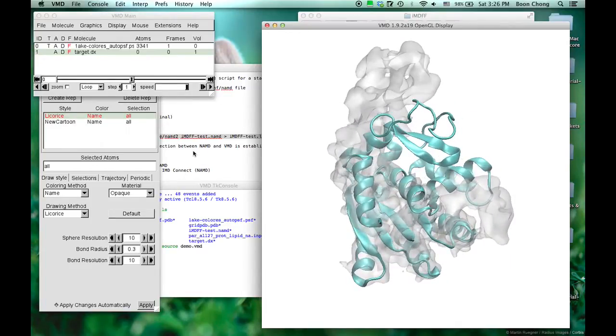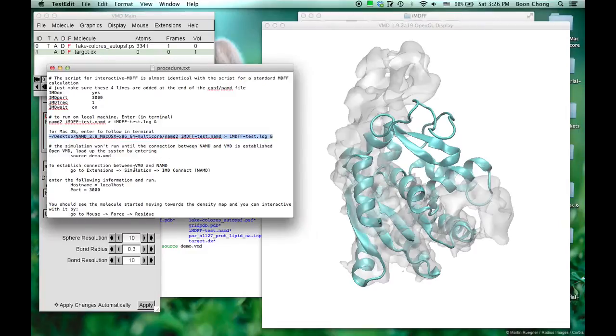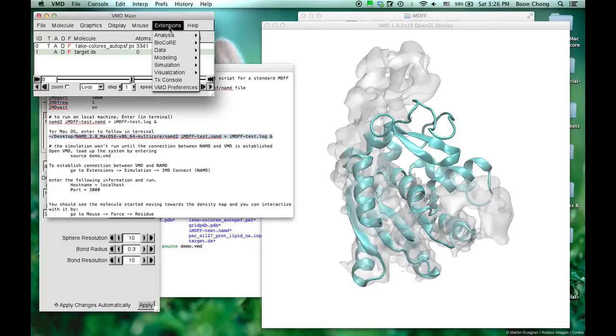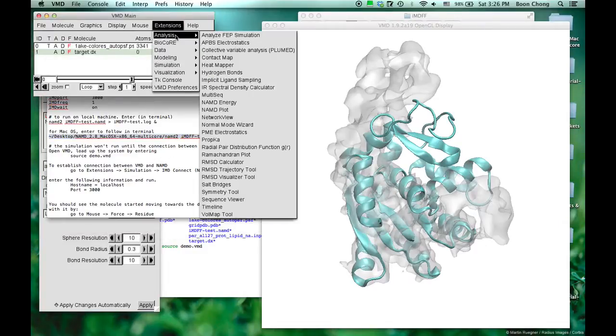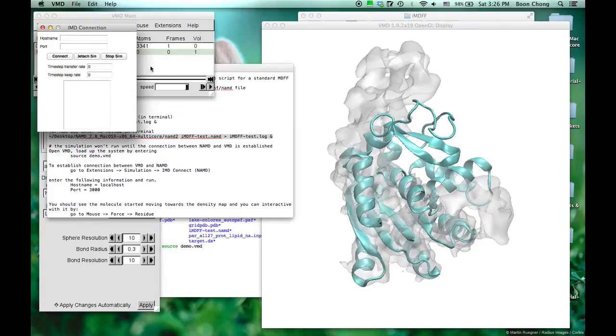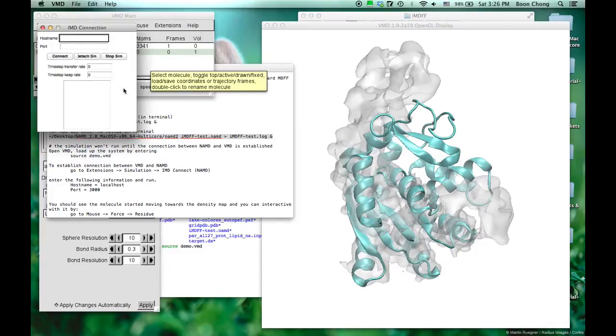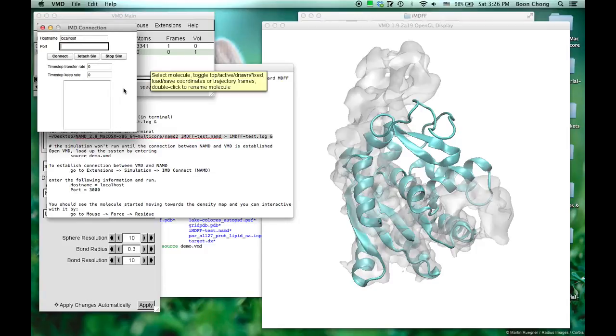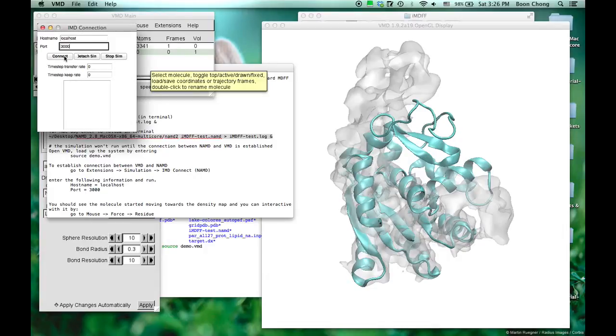Let's run the show. To establish connection, you go to Extensions, Simulation, IMD Connect. You want to connect it. Previously we set it to localhost. The port previously was set to be 3000. Of course if you like 1234, that's also fine with me.